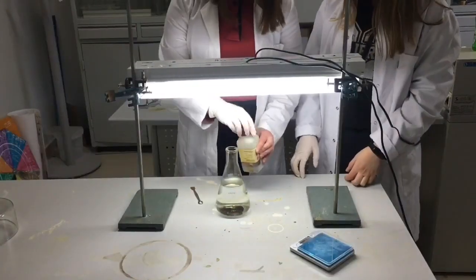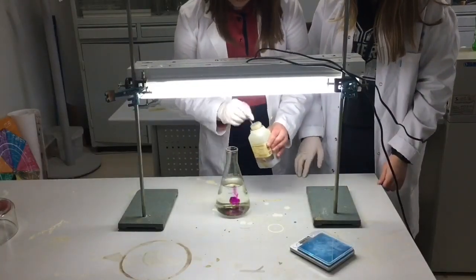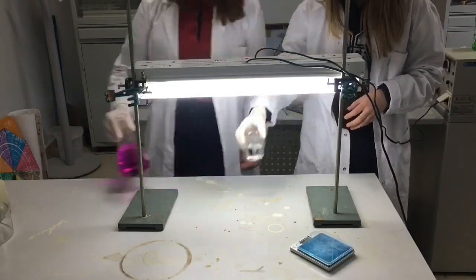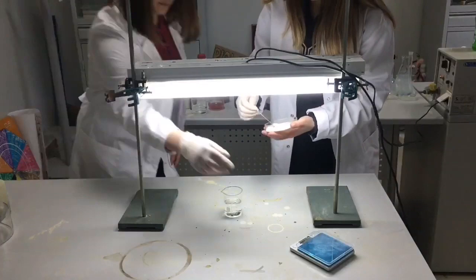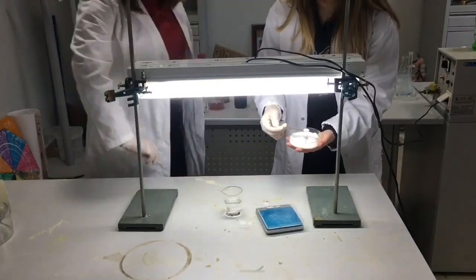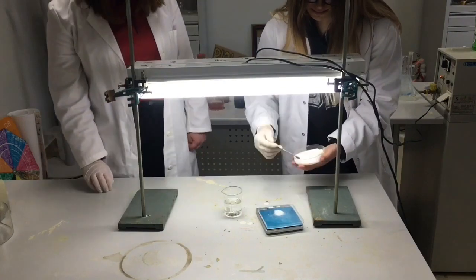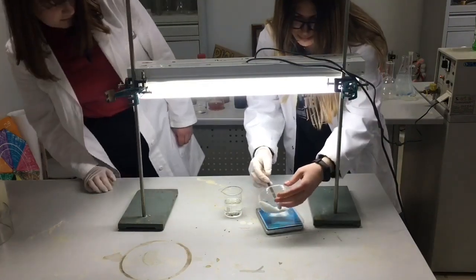First we put potassium permanganate in the flask. Then we mix 2 grams of sugar with 1 gram sodium hydroxide in 75 ml of water.